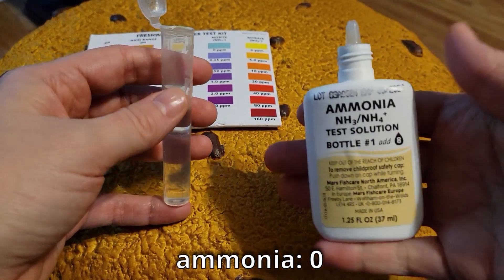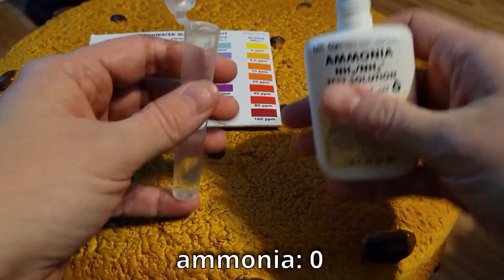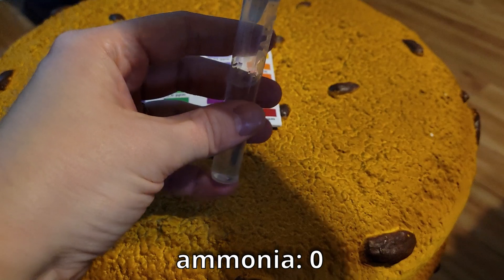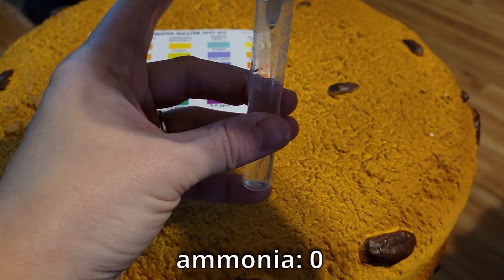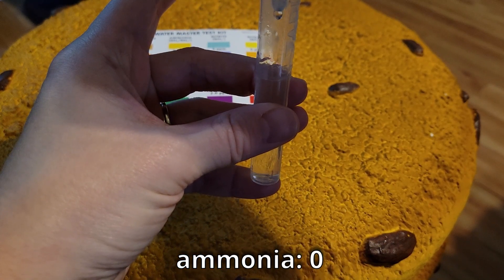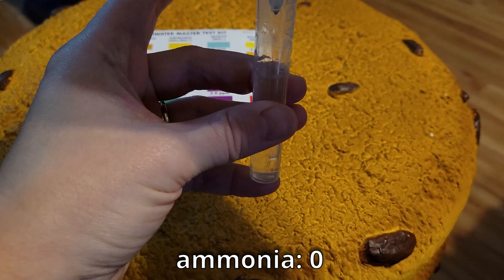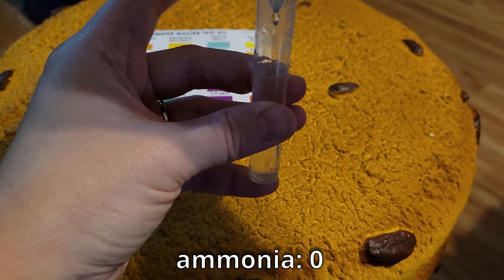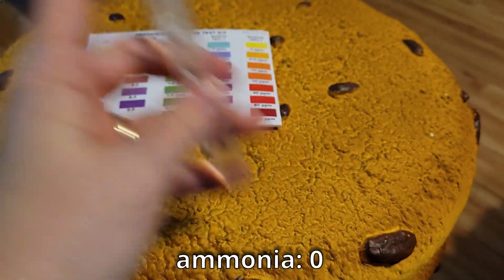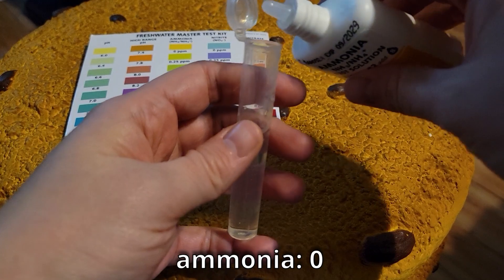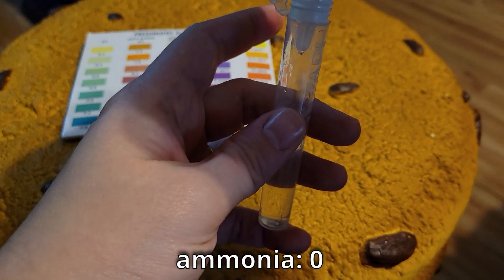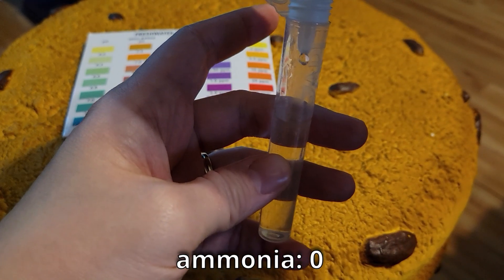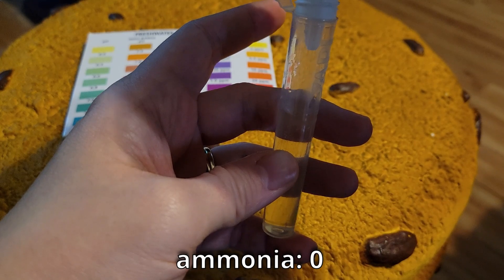Now for the ammonia, you are going to have two bottles. So you're going to put the eight drops from bottle one in the test tube and then shake that up, and then we are going to add eight more drops from bottle two. Shake that up and then you wait five minutes for the test to develop.